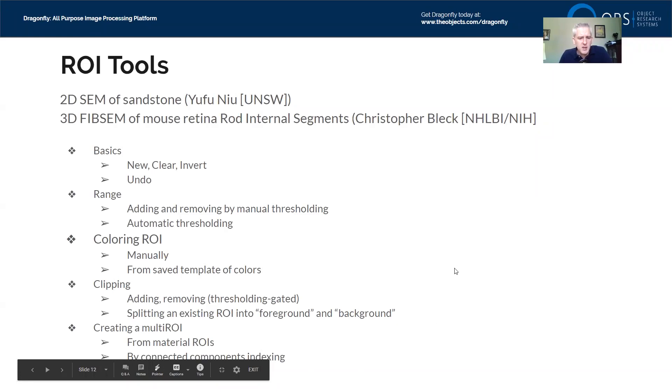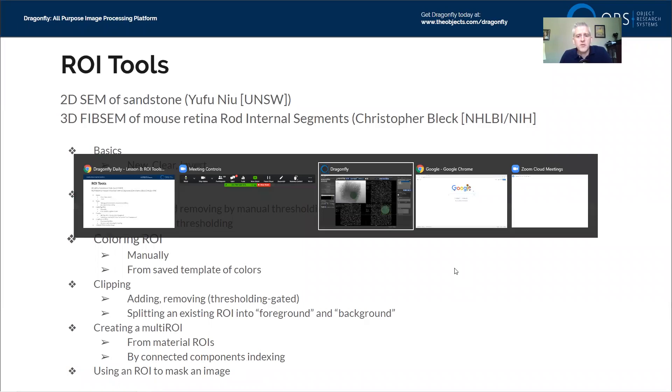There's one more topic: using an ROI to mask an image. So with that said, let's go over to find the data we're going to use for today.